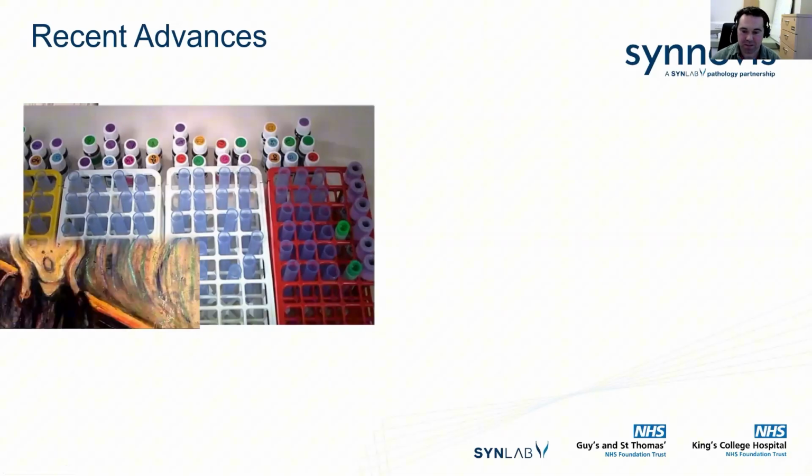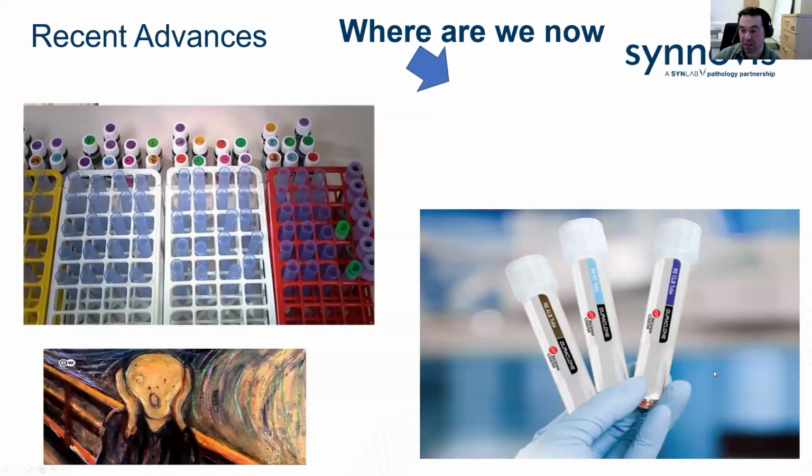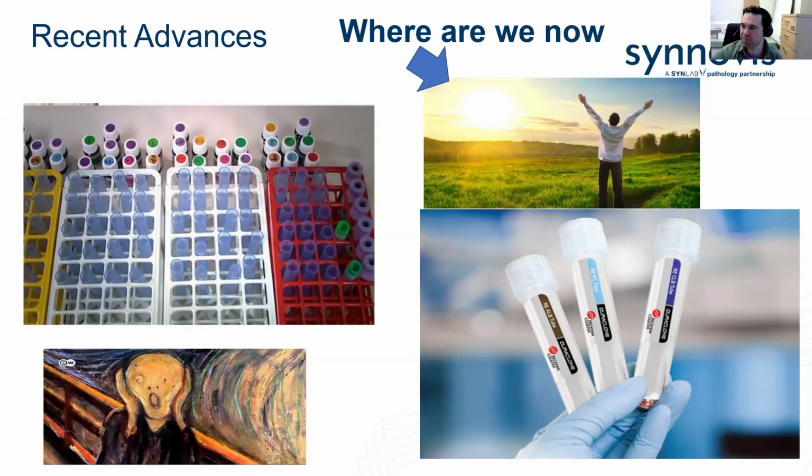Nowadays, we have this new technology called Duraclone technology, which is dry down antibodies. So we don't have to do this aliquoting out of liquid antibodies anymore. We simply pick a tube off a shelf, we add the sample to it, we incubate, we lyse, and then we run on the analyzer. And it has removed quite a lot of heartache. Oh, happy day.